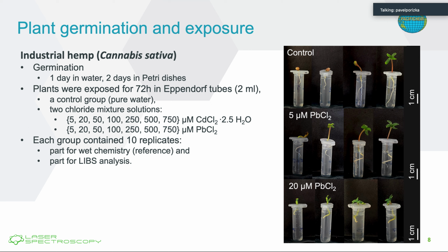do LIBS. And LIBS is quasi-destructive, so after the analysis the plant is going to be evaporated. So that's the point. We are doing either one scan if the sample is really flat, then it's evaporated after one scan, after one map, or we repeat this until there is no plant to be seen on the surface. So we are destroying the whole plant with laser ablation.